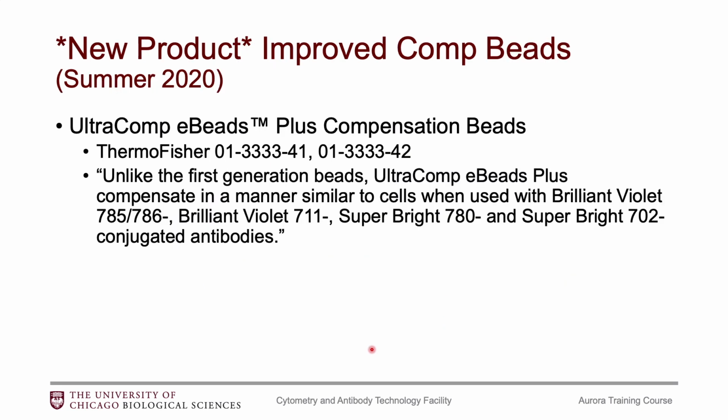Lastly, people ask me, what compensation bead should I use? Does it matter? I don't have a perfect answer for if it matters or not. I personally have only tried beads from Thermo Fisher, and I will tell you that out of the Thermo Fisher beads I have tried, the UltraComp eBeads Plus are the best ones from them. But there are lots of other manufacturers that make beads, so you don't necessarily have to use these ones, but these are the ones that I have found work.